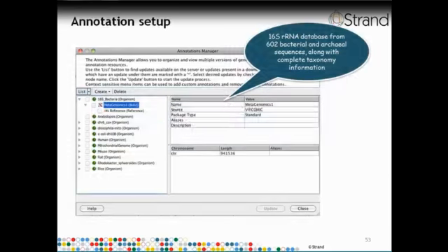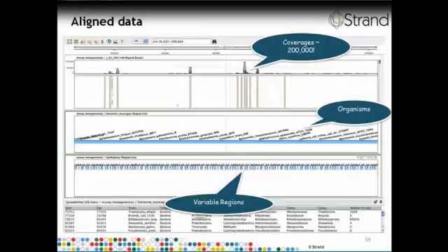We can also load the SAM files to observe the depth of coverage at different points of the contig, and to observe whether the paired reads which are aligned against this contig support the insert length distributions that we expect, and so on. So here you can see that the first contig had length 17 kb. The coverage is reasonably high across most of the contig, but we do see certain discrepancies. We can see certain locations where the consensus sequence doesn't really agree with the contig.